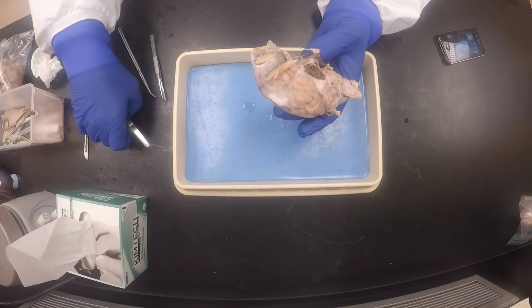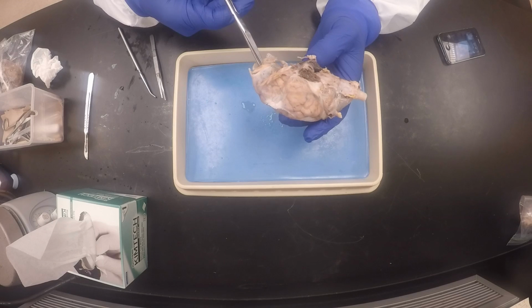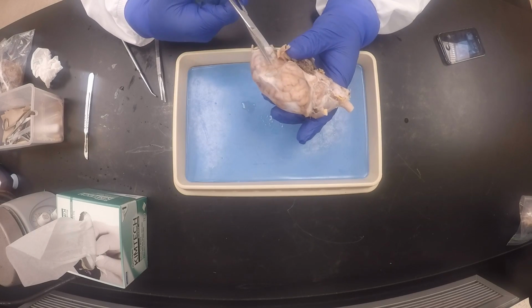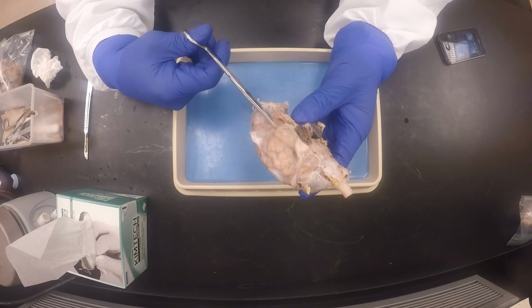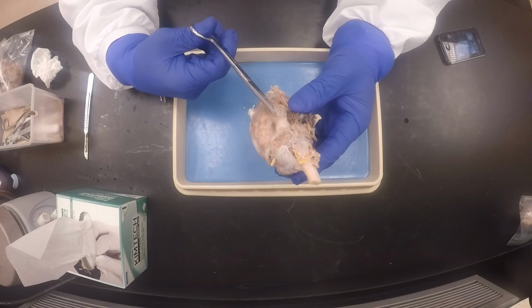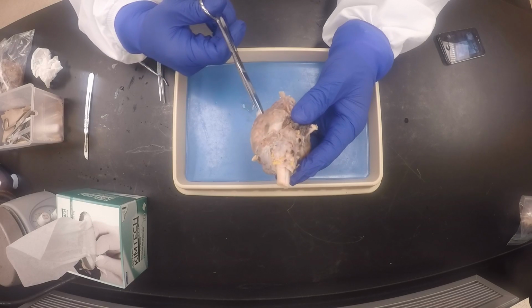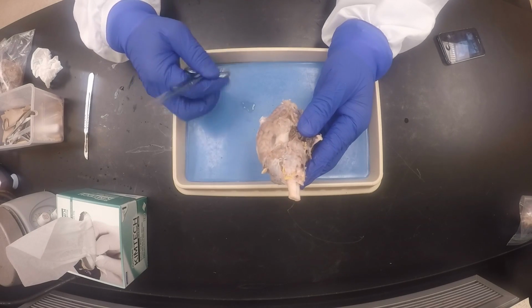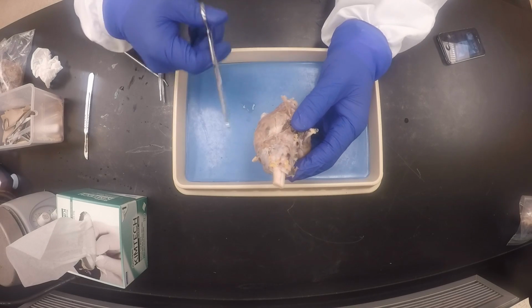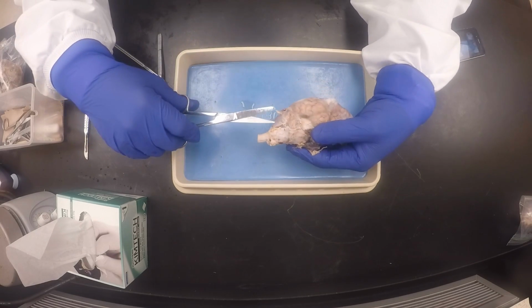Okay, we won't be able to see the other two meninges because they are very intricately connected to the brain. So I'm going to cut. I just have you watch the eye and then the brain, because the brain has a lot of things for the second day. Once you get here, you want to really go in there and cut the tentorium cerebelli, which is really the toughest part of this.